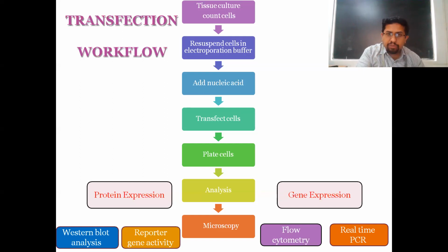You grow them. After you grow them, then you analyze them. Look whether your gene of interest has been expressed or not. How do you do that? 3 broad methods. One is microscopy: is there any change in morphology of the cells?